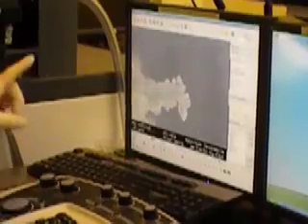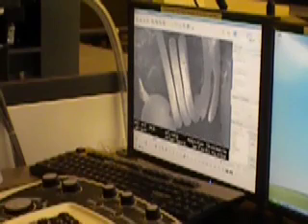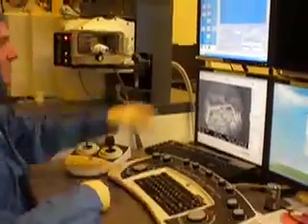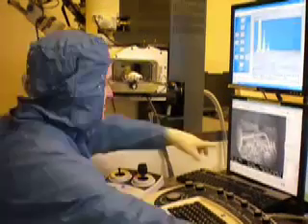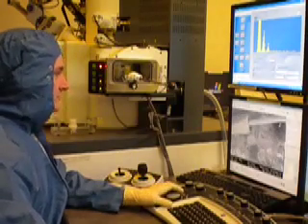What we're looking at are small crystals of tungsten that are on part of a headlamp filament from a car. So you'd never believe that that was something on something so large. Another really cool thing that we can do is tell what elements are present. So I can start acquiring a spectrum that will tell me what materials are there, just because of the energy that I'm using to acquire that signal.